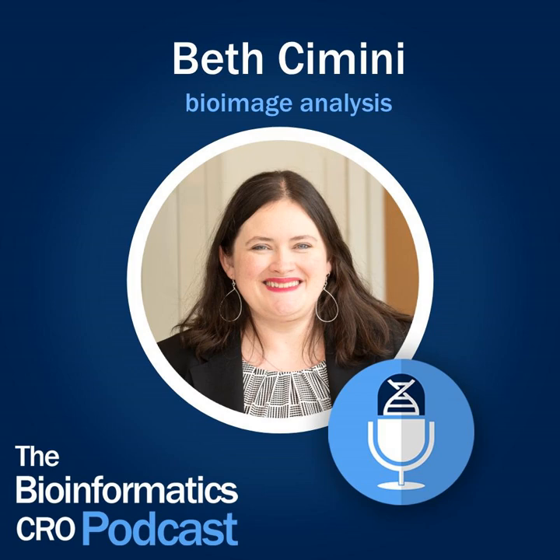And so you have all of these really exquisite differences that don't matter, that are not what you want to detect, but they're all mixed in with the differences you do want to detect, which are, again, the things in biology. So being really careful with experimental design when you're doing an imaging assay, especially something like cell painting, where you're not always putting your controls in the same places, or making sure maybe you don't even know what's plated in each well. You ask your friend to plate it for you and write it down, and you treat everything in a completely blinded fashion.